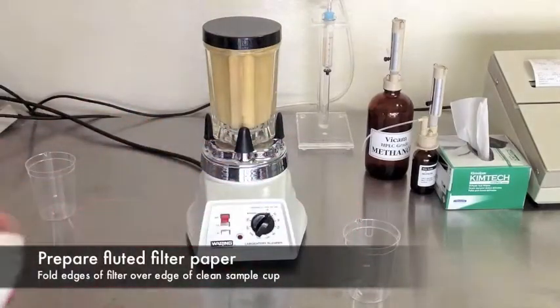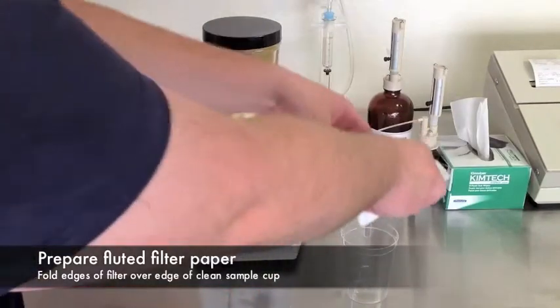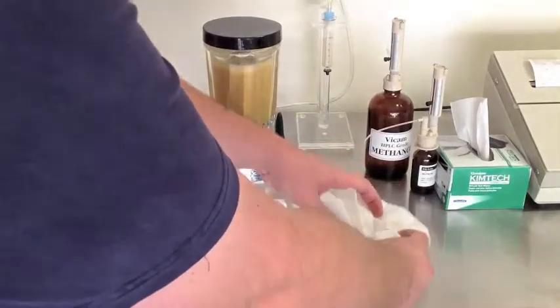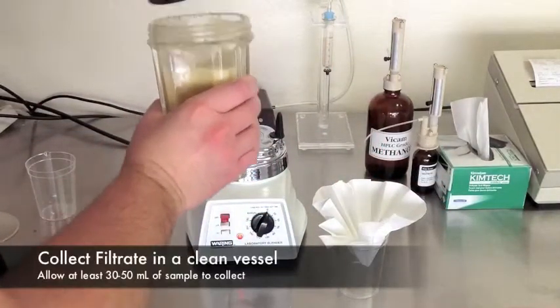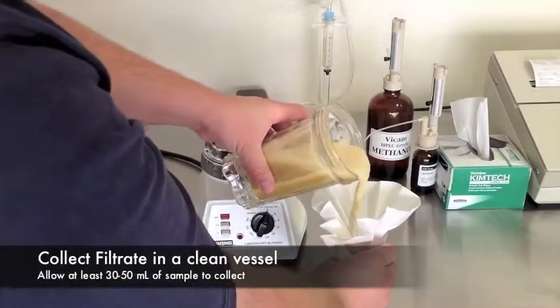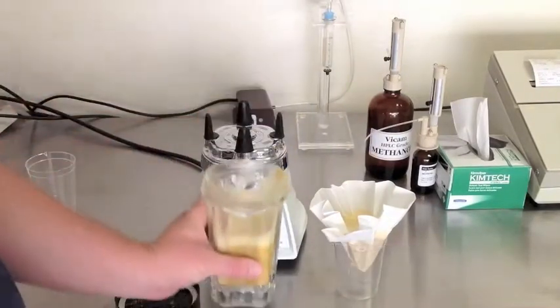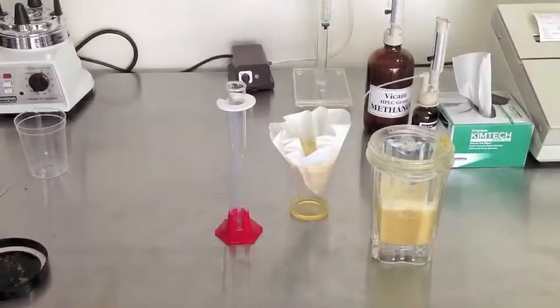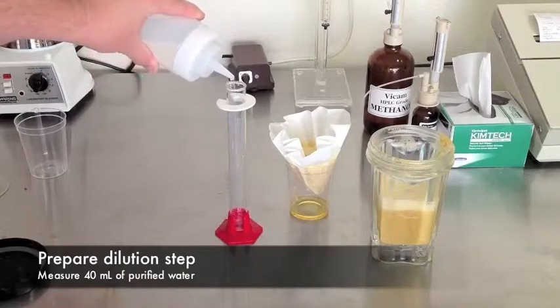Prepare a fluted paper filter by placing it into a clean collection cup. Next, you'll pour your blended mixture into the filter and begin collecting the sample. While the sample filters through, prepare for your next step of the procedure.